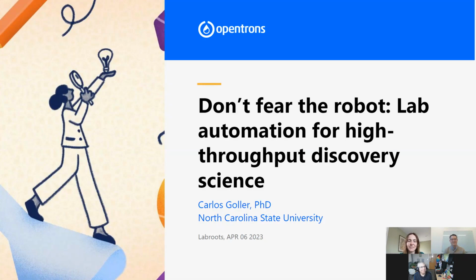I think this is a tough question. It depends. If we have undergraduate and graduate students, some graduate students now go back to their labs and ask, for example, do we have access to someone on the floor with automation? Can we get an Opentrons? Can we look into automating this process because we do it routinely? And some undergrads go out and get jobs in biotech and come back and say, guess what? I've been using this or that instrument and I've been doing this.